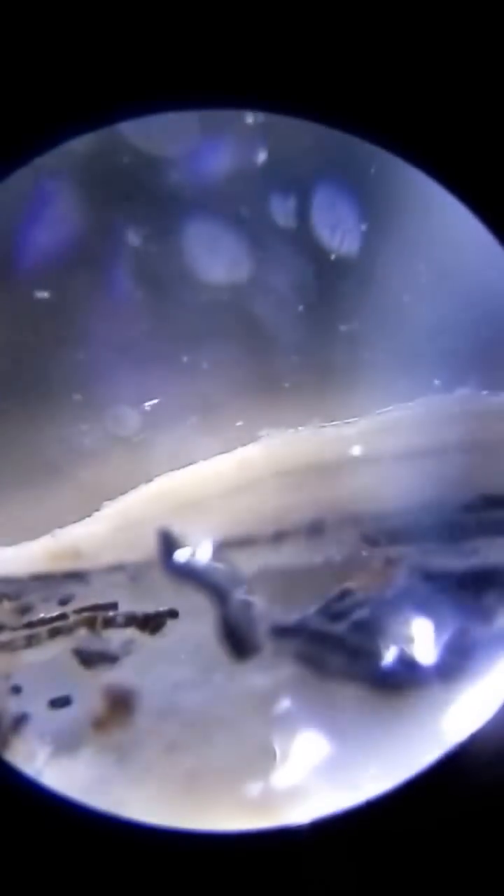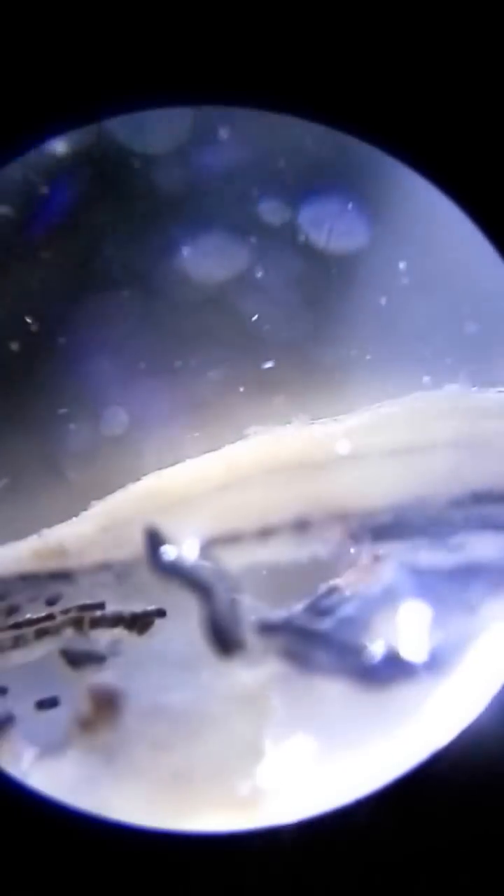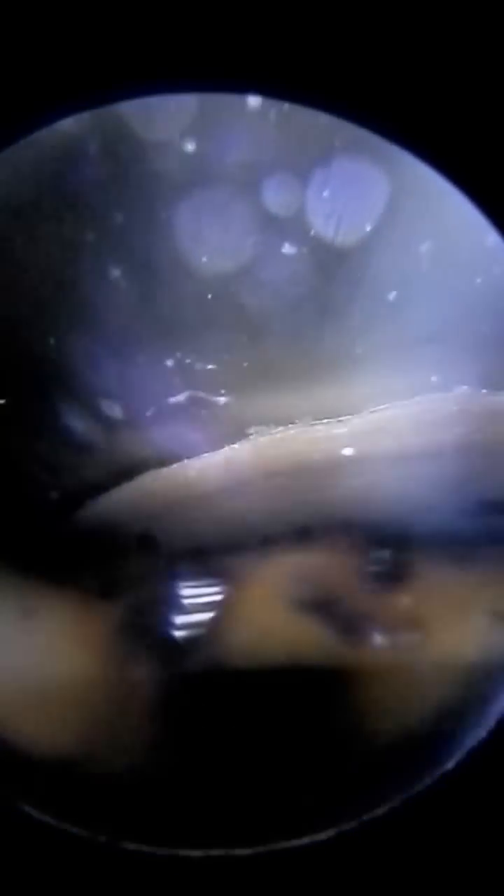I can see spirochetes swimming in here. I wish I could give you a better video. You guys see that? See that swimming? Check it out. He's moving freely.